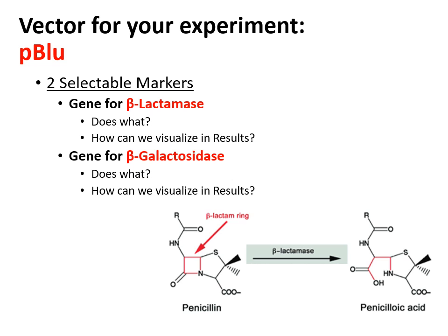Now, like I said, we visualize that based on plates with ampicillin or without ampicillin. If bacteria took in the pBlue vector, it should now be able to produce beta-lactamase, which means that if you grow it on a plate with ampicillin present, we usually write it as AMP, these newly transformed bacteria can now cut that ampicillin and survive on that plate when they would have been killed previously.